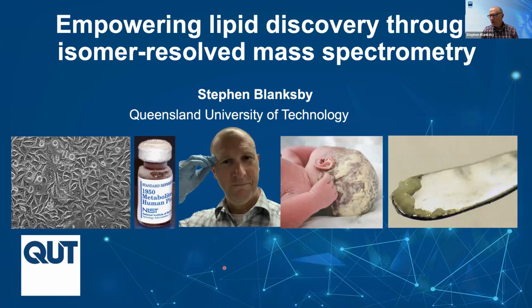What I wanted to talk to you about, I know that the seminar program very much focuses on the biology of lipids, and that's crucially important. But what I'd like to focus on today is the technology that enables us to discover the molecules of life, and the lipids in particular, and some of the contributions that we are making to that. More to introduce this idea that by advancing the toolbox of lipid mass spectrometry in particular, we can advance our understanding of lipid biology and indeed discover new lipid metabolism, new lipids, and new biology. So that's the aim today.